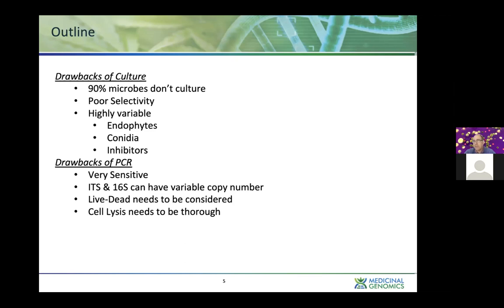So there are techniques that you can use to enrich for things that are live. You can perform enrichment, that's one way. You can centrifuge things, which pellets the cells and leaves the free-floating DNA in solution, or you can use nucleases. And we have been employing a variety of those techniques in the methods. One thing that is really critical moving from bacteria to fungi is you really need to understand your cell lysis. And this is something we arguably didn't fully appreciate in the last few years and have recently modified our protocols to address.